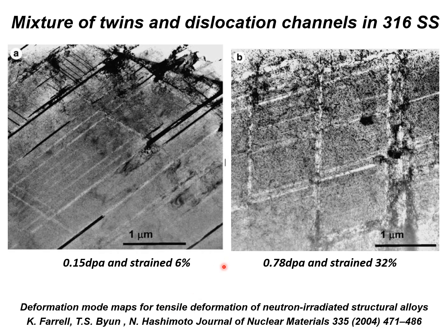So in many cases, when people are looking at the microstructures of irradiated steels after irradiation, they often identify complex structures, and they're often identified as a mixture of twins and dislocation channels. I haven't explained what a channel is, or a twin, in fact, but I will get on to that. All you need to know right now is that there are two types of defect which can be misinterpreted, one for the other. One is a channel and one is a twin.